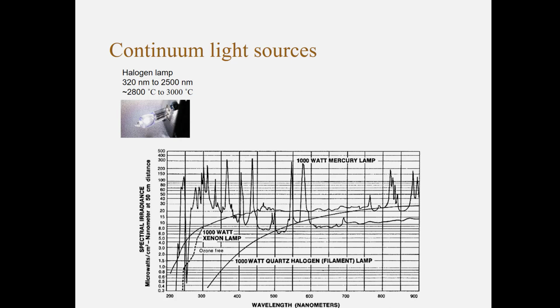The plasma was 6,000 degrees, but there's no metal which can take that high temperature. So we first choose a metal which can withstand a very high temperature without melting, and that's normally tungsten or wolfram. And then in the case of a halogen bulb, we fill it with halogens.